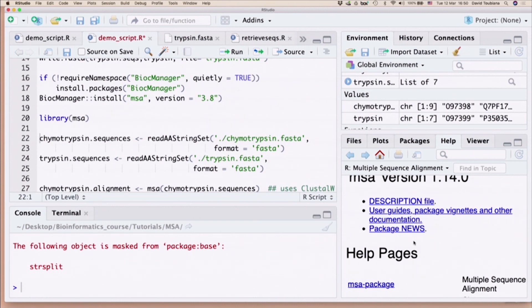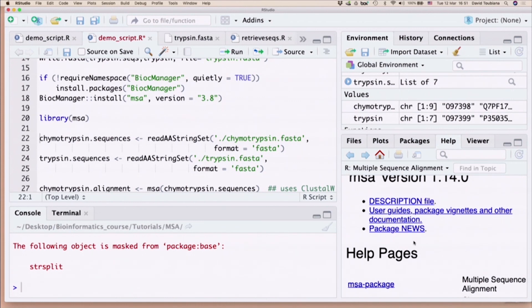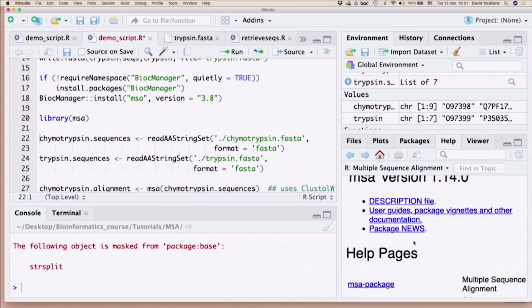To read in a FASTA file, we can tell it: read in as the format is FASTA, read in an amino acid sequence, and this is the file that I want to read in. The dot sign refers to your current directory. I like to use it just to make sure that I'm in the right directory. I'm reading in the FASTA file that I wrote out before, and I'm assigning the sequences to two variables: chymotrypsin.sequences and trypsin.sequences. All done?